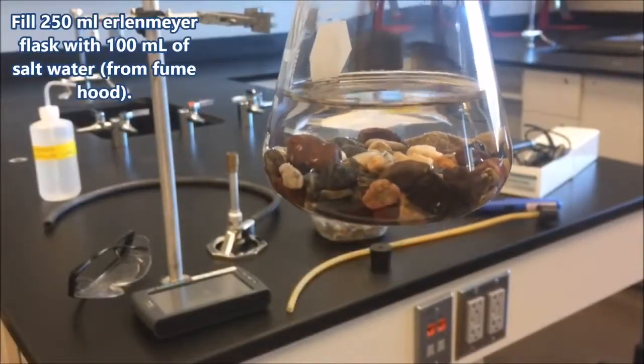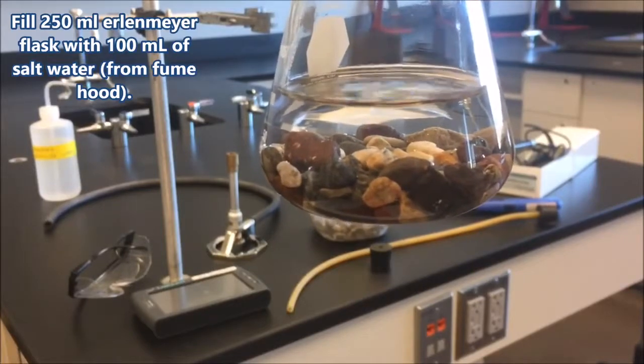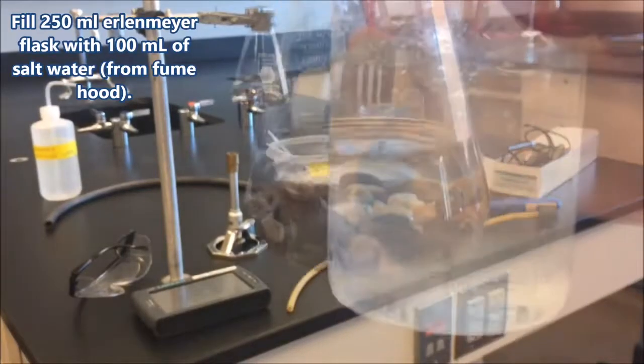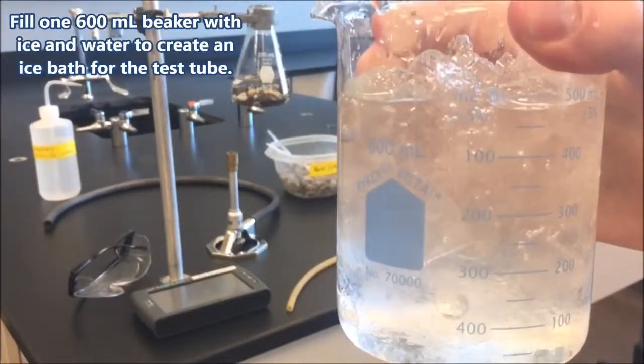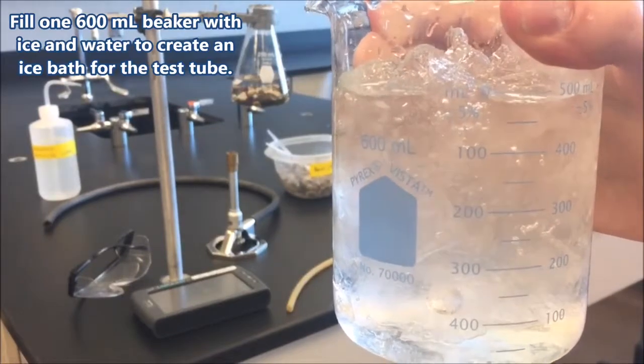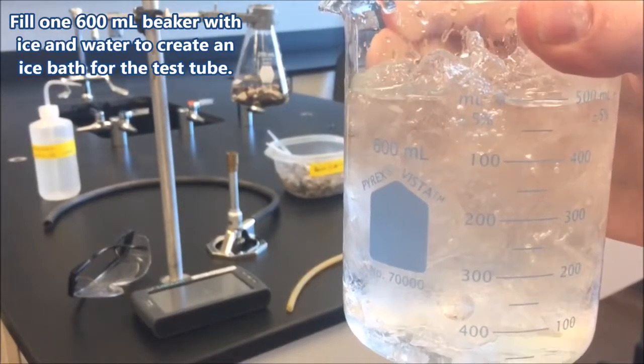And then we want to add about 100 milliliters of salt water from the fume hood in the back. And then you're going to want to fill one of your 600 milliliter beakers with some ice and water to make a nice ice water bath.